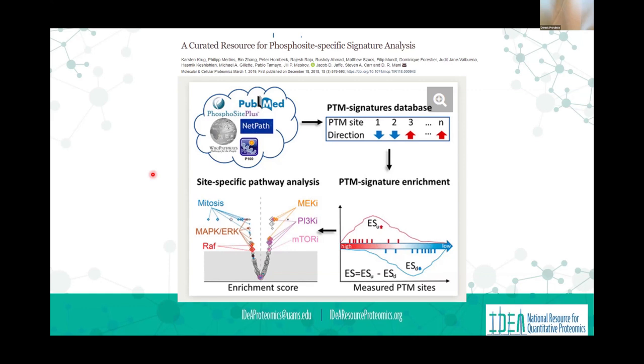And we have a colleague at St. Jude's who's almost actively encouraging his researchers not to do it, because it's a lot of work. They take weeks to generate the data, and will identify 30,000 phosphorylation sites. And then people sit on the data and don't know what to do with it. It's like, that's a lot of work. We could have been doing something else that you would move forward on. And so, I think that it has to be in the right case.